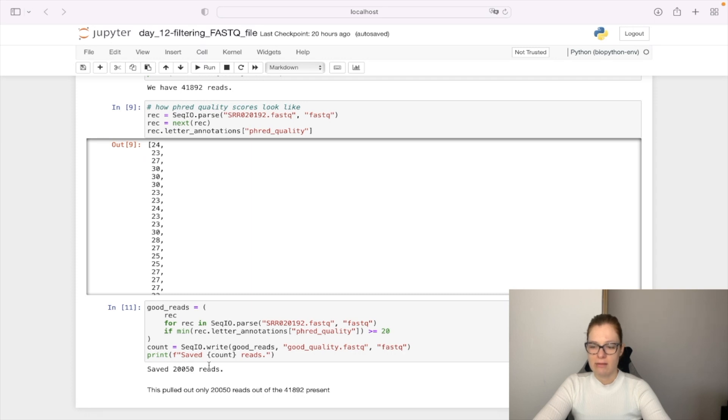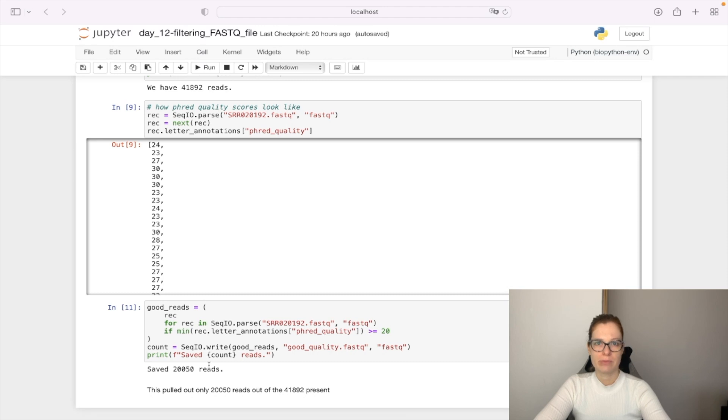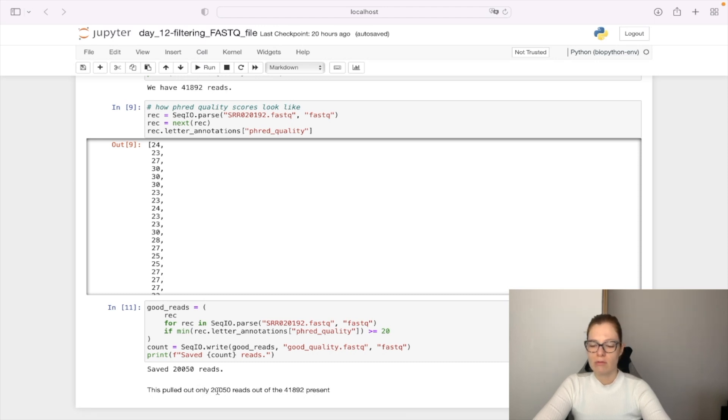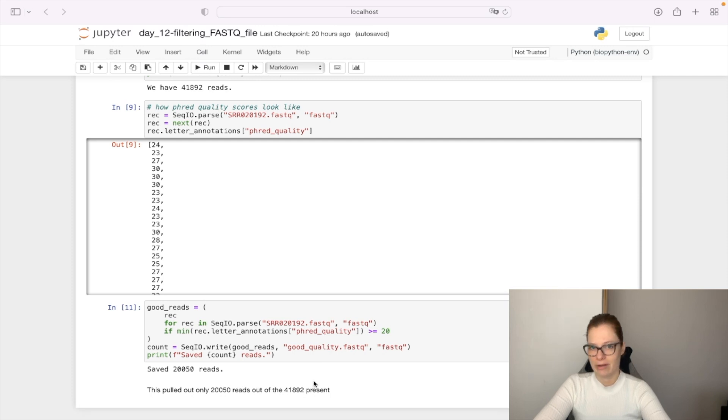This means we filtered almost half of the data due to bad quality scores. We pulled only 20,050 reads out of the 41,892 present.